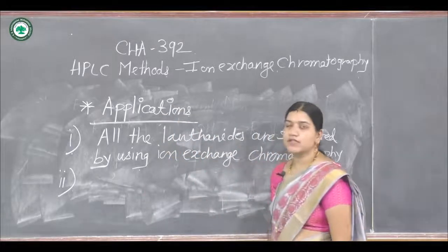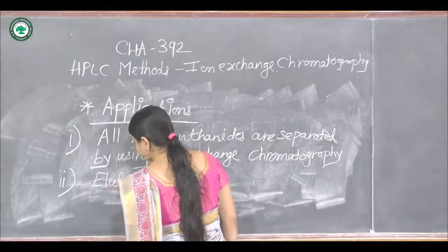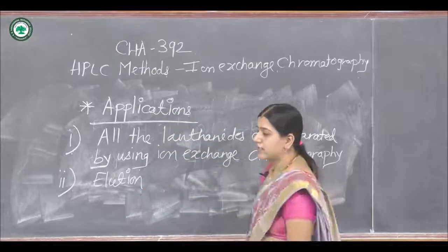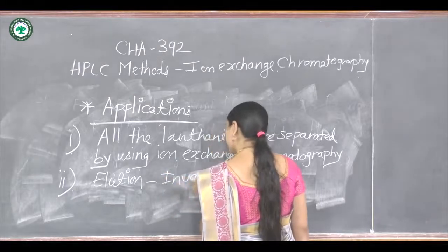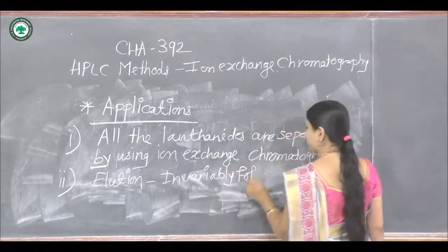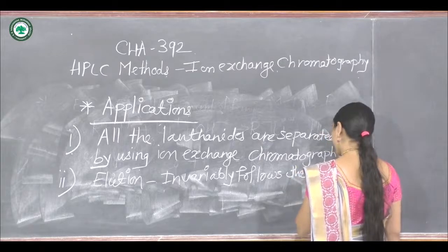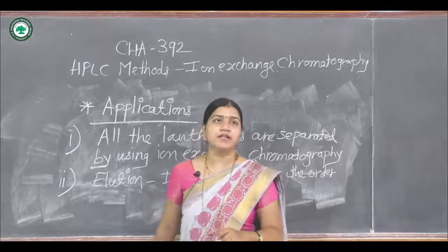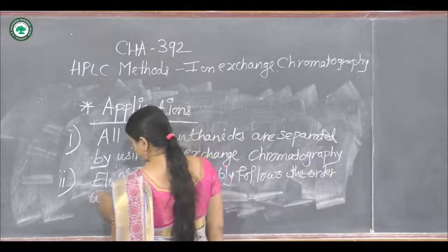Now the second one is the elution. Elution invariably follows the order of decreasing atomic mass.